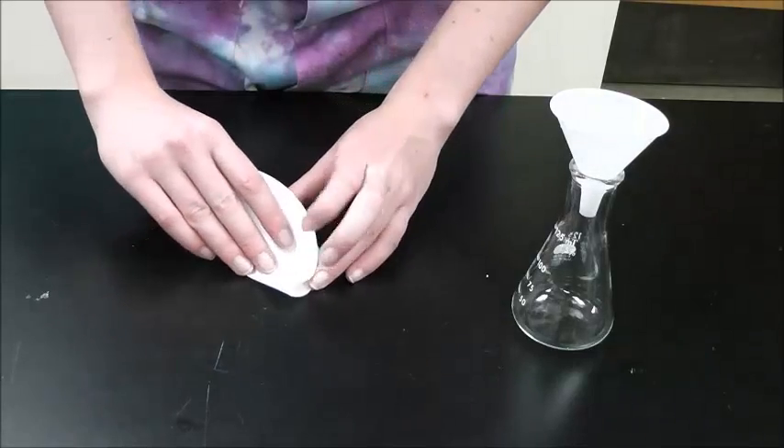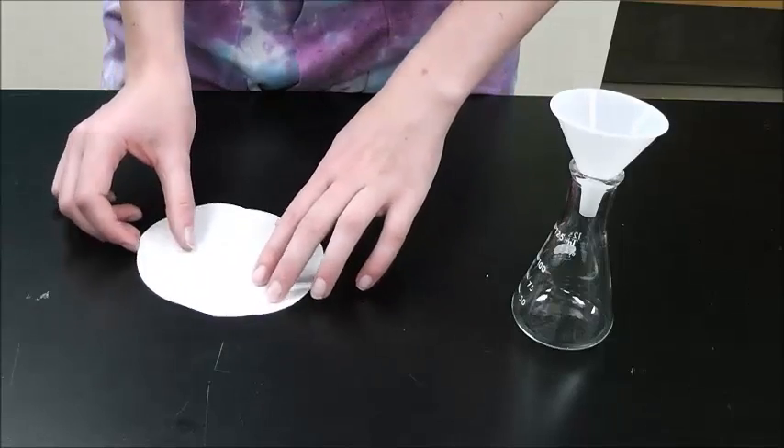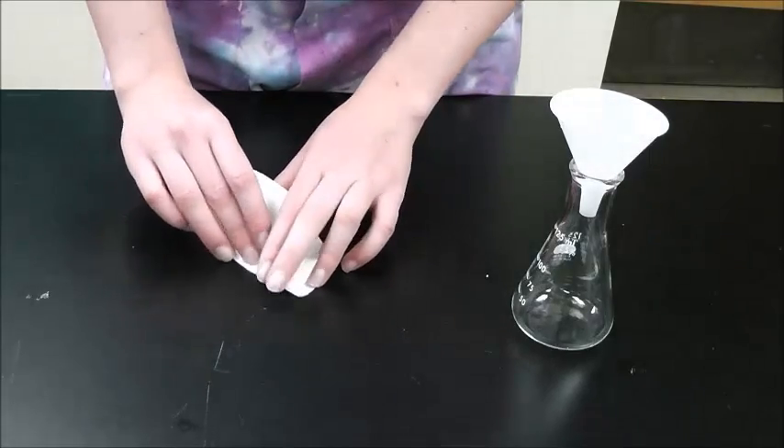When you are folding your filter paper, do not use a ruler or press too hard with your fingernail when folding, otherwise you might cause small rips in your filter paper.